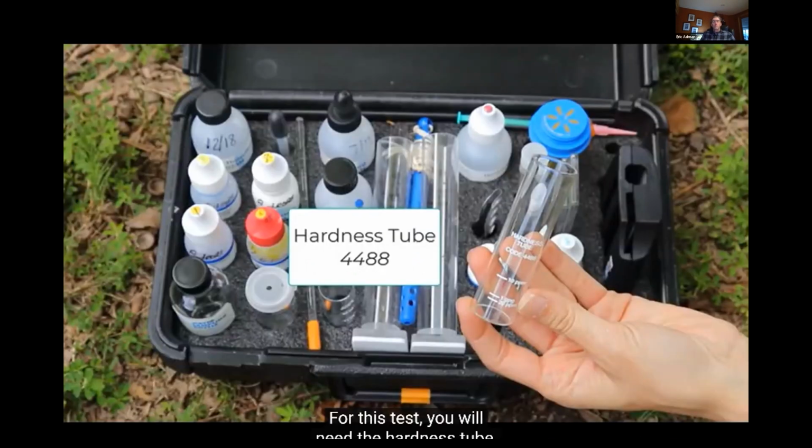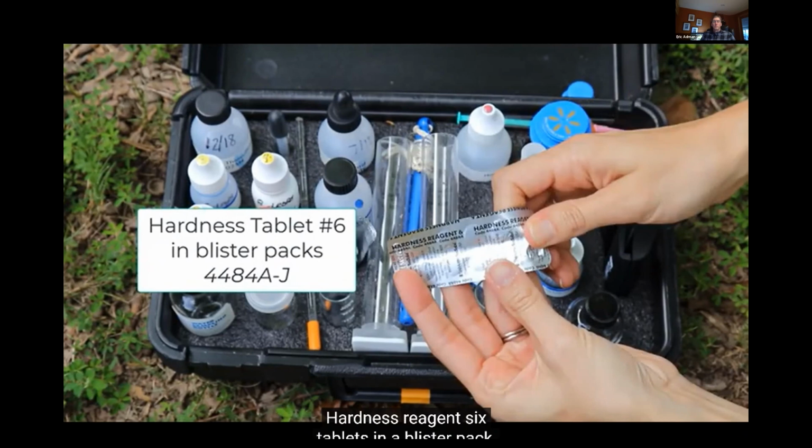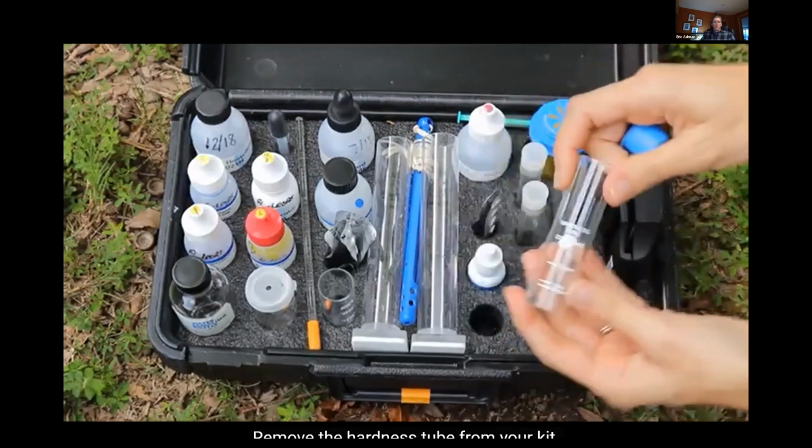For this test, you will need the hardness tube, code 4488, hardness reagent number 5, code 4483-E, hardness reagent 6 tablets in a blister pack, code 4484A-J, and hardness reagent 7, code 4487WT/H. Remove the hardness tube from your kit.